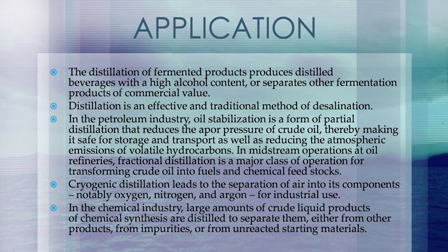The latter two are distinctively different from the former two in that distillation is not used as a true purification method but more to transfer all volatiles from the source material to the distillate in the processing of beverages and herbs. The main difference between laboratory scale distillation and industrial distillation is that laboratory scale distillation is often performed on a batch basis, whereas industrial distillation often occurs continuously.